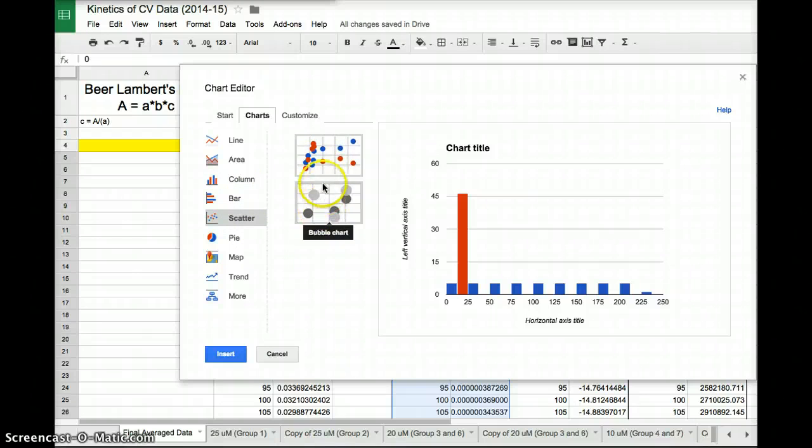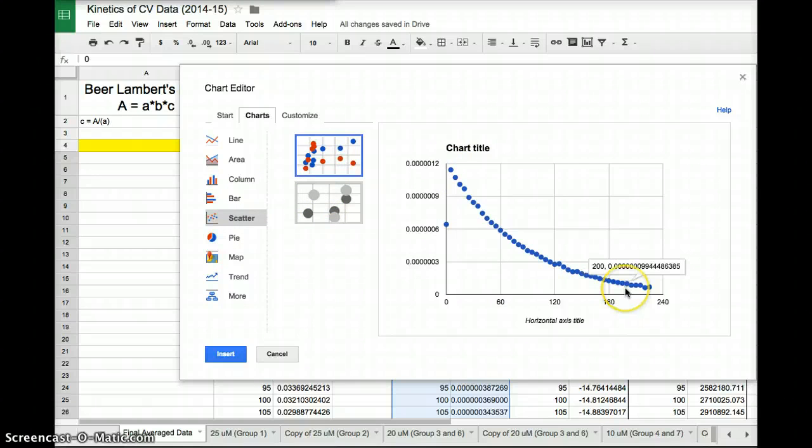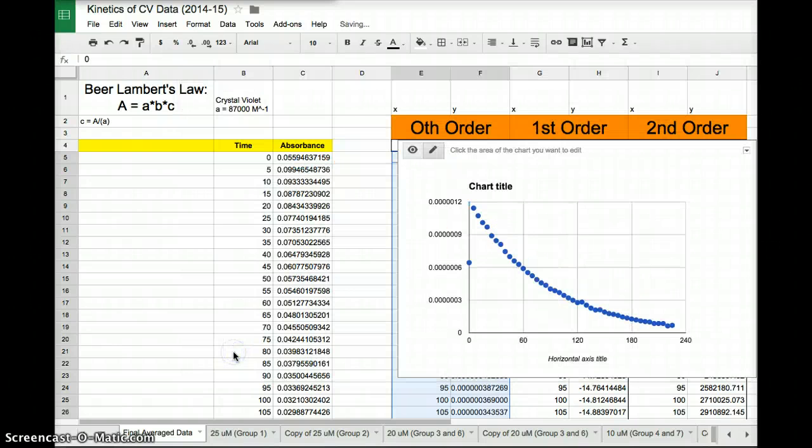Then it gives me two options, a bubble or a scatter. We want this top one with the red and the blue. And boom, it gives you a little preview of what the data looks like. I click insert, and I'm done.